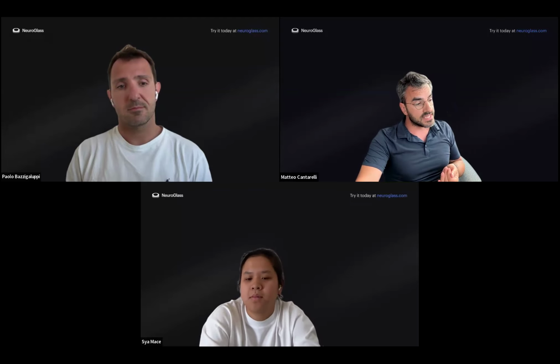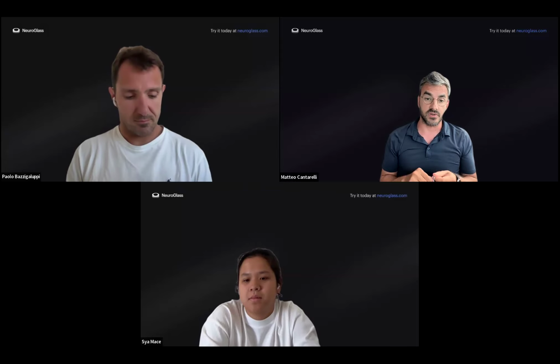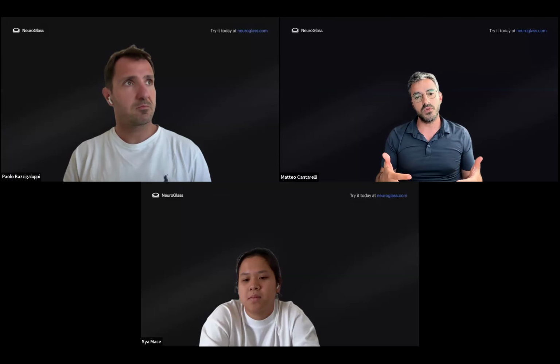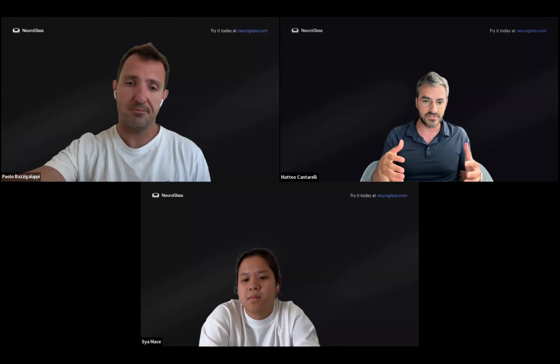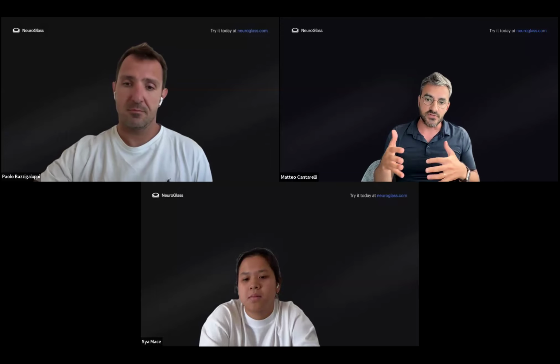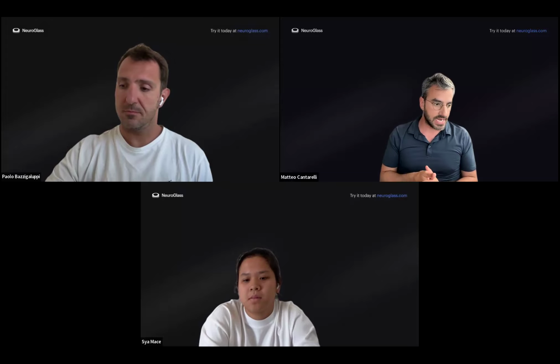And one thing that I want to stress is the collaborative aspect, which for us is very important. Our goal is really to bring together different scientific communities that work on volumetric images and have a platform that can enable different institutions working together across different workflows and different modalities.